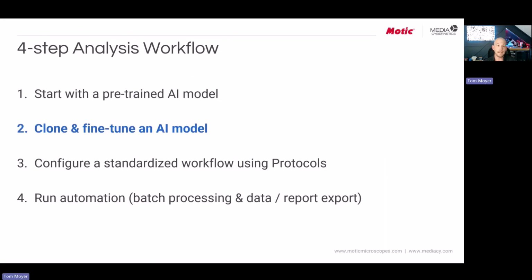So that is the segmentation process using AI. Again, we use the same training tools, prediction tools, for all of these applications. This could be training a model to find bread, either the whole piece of bread, or it could be the voids within. You have to learn just one set of tools, and now you can apply that to any image, any application.